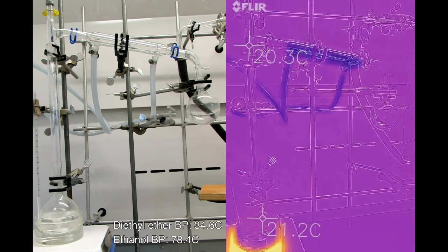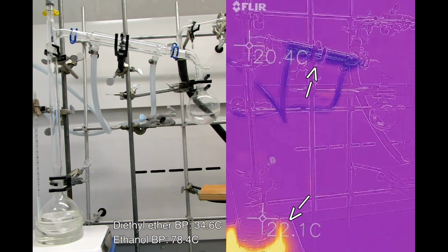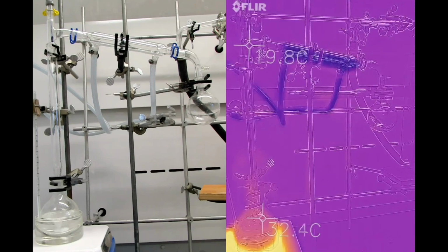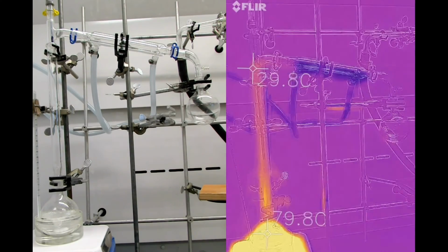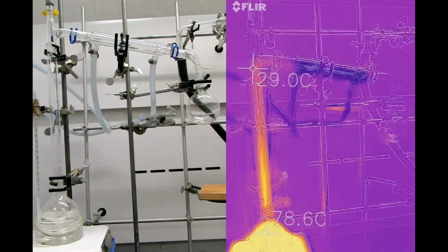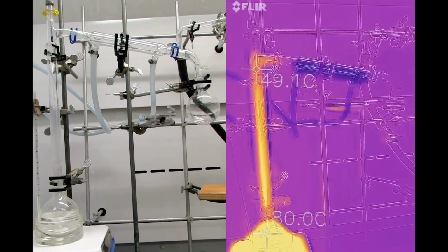I added some ethanol and diethyl ether into the apparatus and began heating. Right away you can see the colder condenser column and the hot plate as it heats up. With further heating, the diethyl ether boils and climbs the fractional column. Once the ether finishes distilling, the ethanol boils and begins climbing the fractional column. This gives an excellent visual of what is occurring during a fractional distillation.